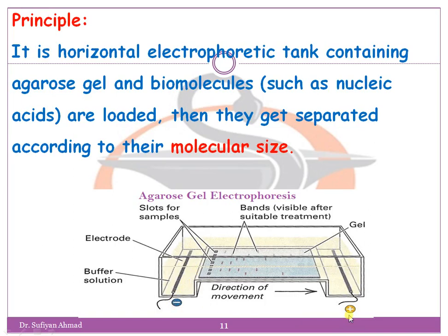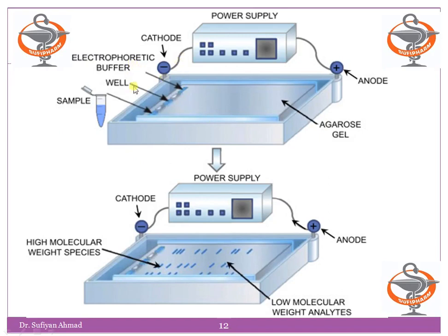As in a sieve, the larger particles stay above and particles smaller than the pore size pass through it. Similarly in the gel, the larger and bulky molecules stay behind, whereas the smaller molecules move faster and quickly toward their respective electrode. This process may be imagined like a running competition: the one who is thinner and has a flexible body will reach the ending point sooner than the one who is flat and bulky.